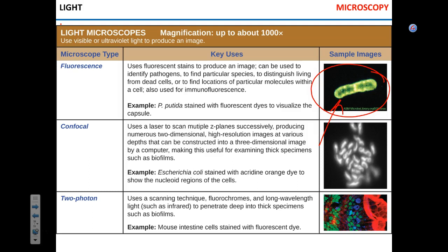Now, it's all fun and whatnot, but in scientific applications, it is extremely useful because you can specifically label cells of interest with highly specific dye and see them fluoresce. One example that is used in applications such as biological and quality control in pharmaceutical companies.